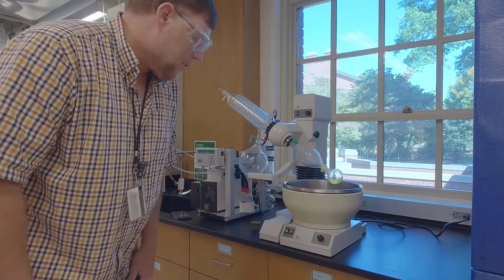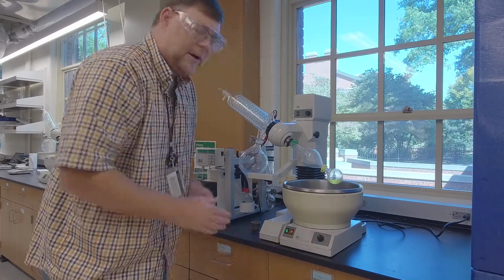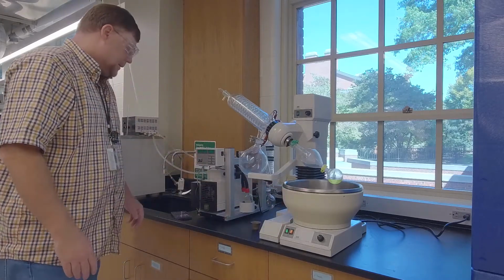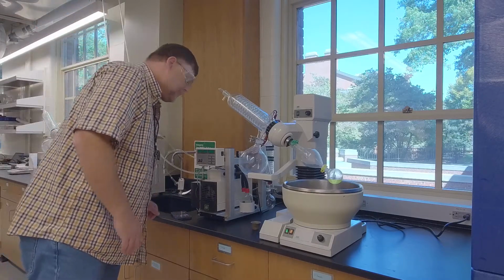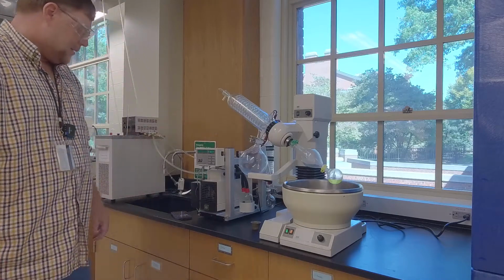I'm going to turn the power on here, and I'm going to turn the dial to 30 degrees. 30 degrees is a little bit warmer than room temperature, but not much. And that's going to just heat this water up to 30 degrees. Now, the next thing I'm going to do is turn on my vacuum source, and I am never good with this thing. There's two. You got to turn it on here and there.